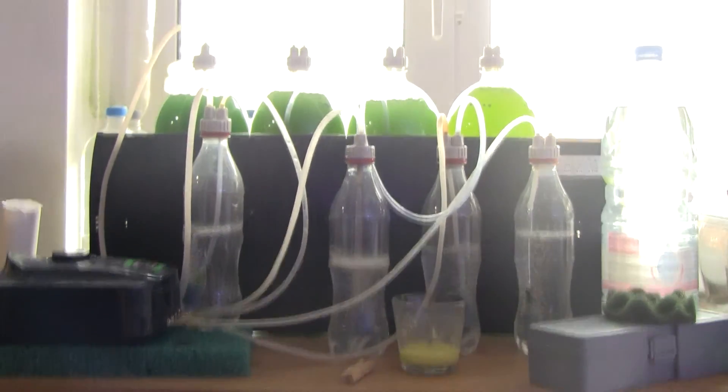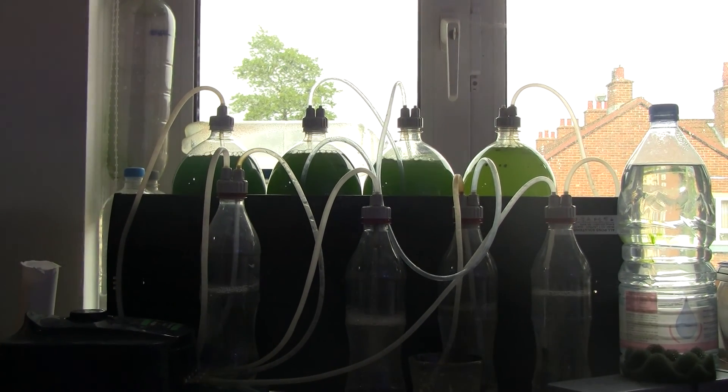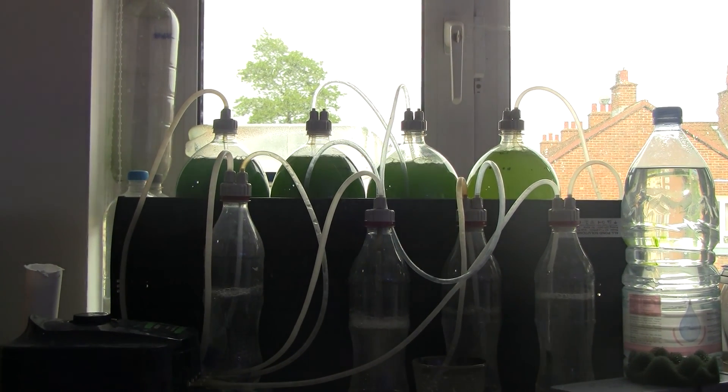Then we go to the four bottles that are there — they're four 3-liter bottles. There's not much to be said there, apart from the caps, which both the Coke bottles and the plankton bottles have. I will show the cap to you later in this video.